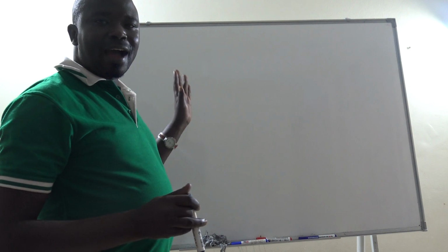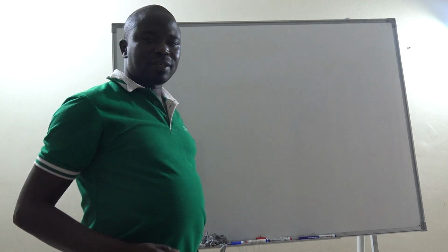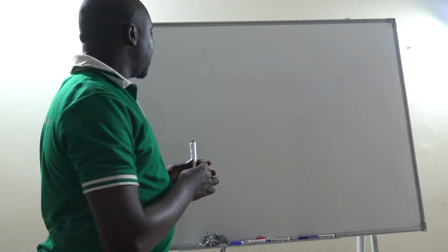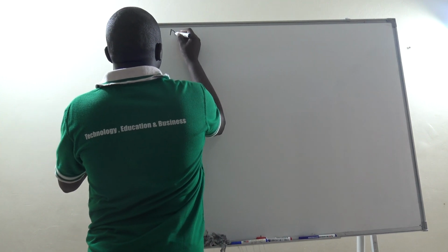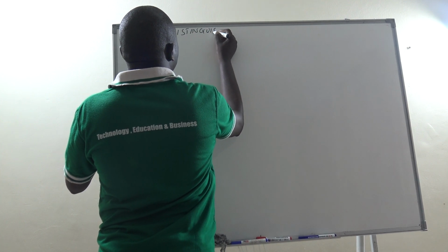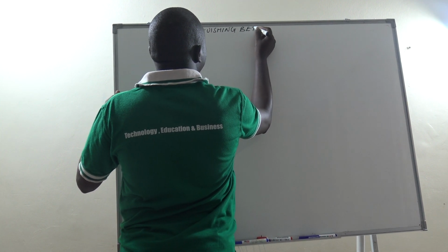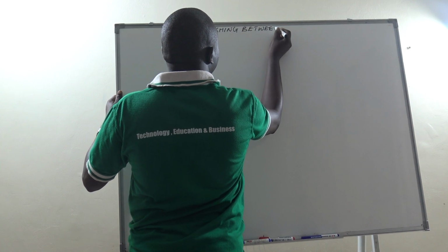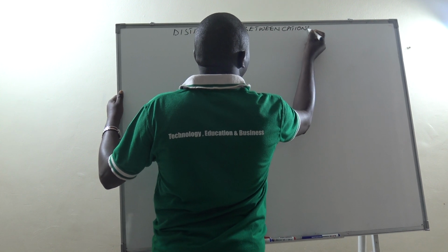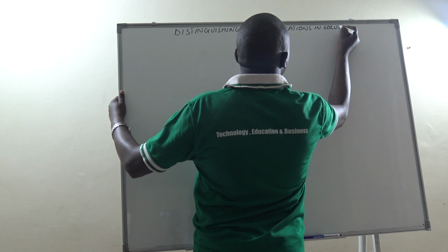We have been looking at how to detect cations using reagents in solutions. So I want us also to try to see, for the sake of our good consumption, how we can distinguish between cations in solutions.